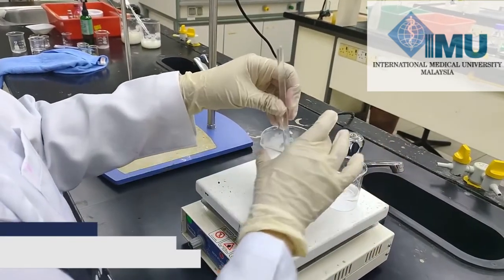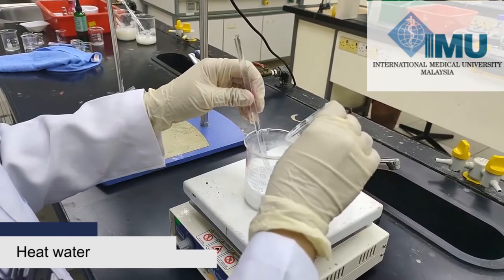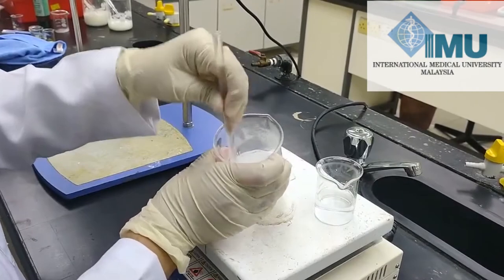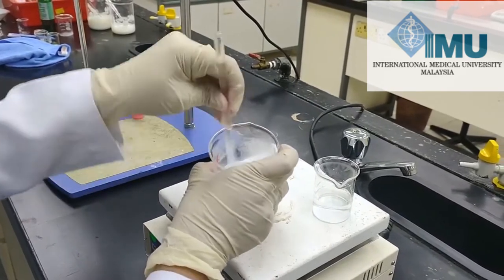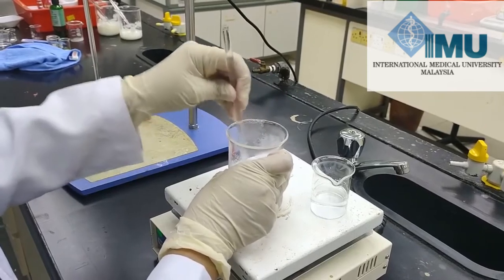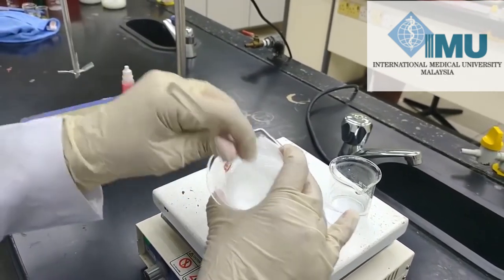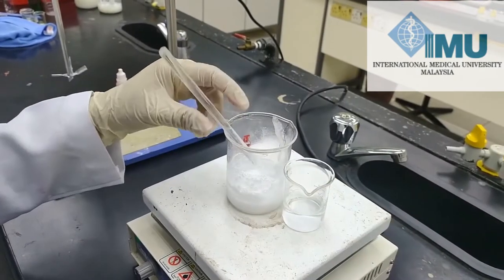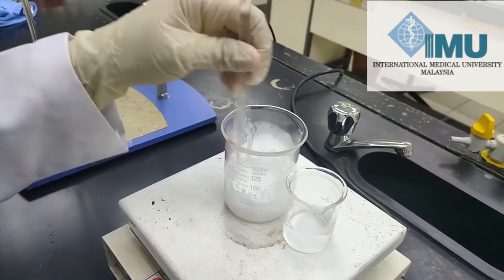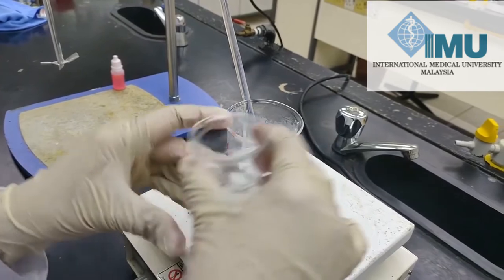Meanwhile, we will heat our water phase. Our water phase is heated up to 60 degrees, because if you add it directly, the oily phase will congeal faster. So we heat it a little, and when you add the water phase into the oily phase it will not congeal. Now we will add our water phase.